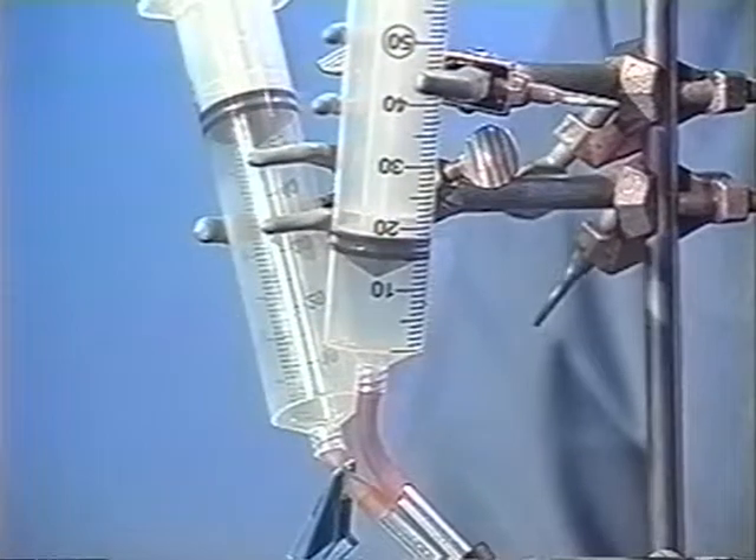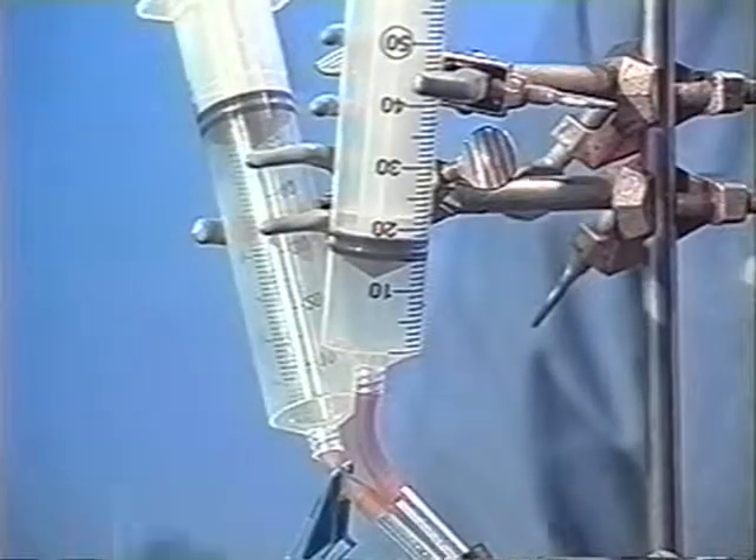When you want to stop the reaction, simply remove the heat and let it cool for a couple of minutes. The plunger on this syringe may go back in a little ways, but that's fine. And then you're ready to go.